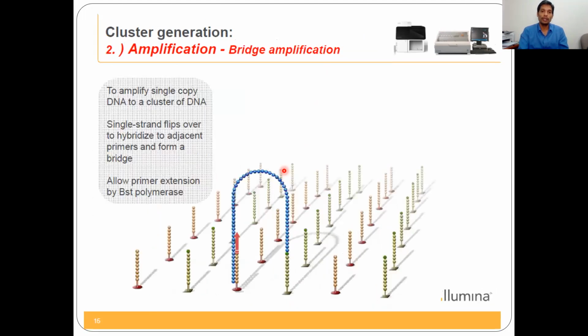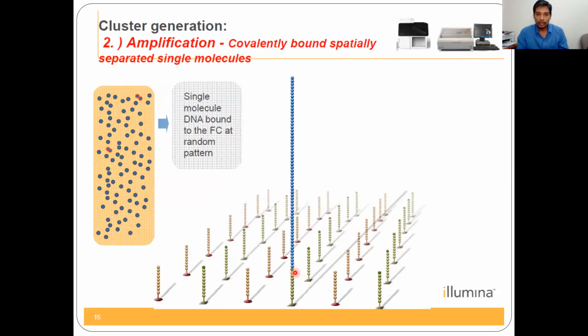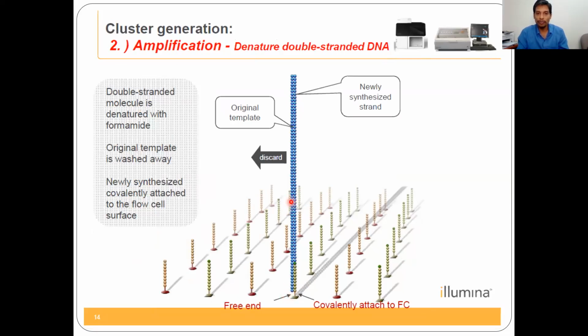Okay, next, this one is the primer which is complementary to one of the adapters. Once the original one attaches here, it has another adapter on the other side. You understand? So this is one adapter, this is another adapter, and in between is the DNA sequence, all represented here as only one color, but you have one adapter on one side and another adapter on the other side.